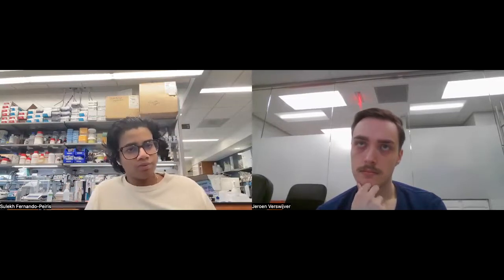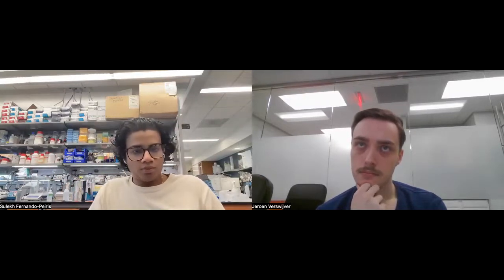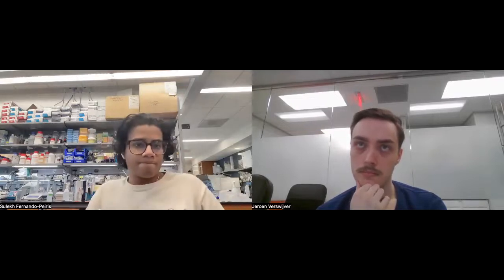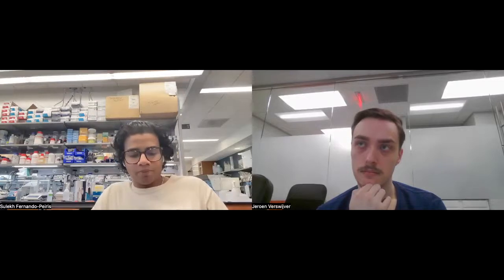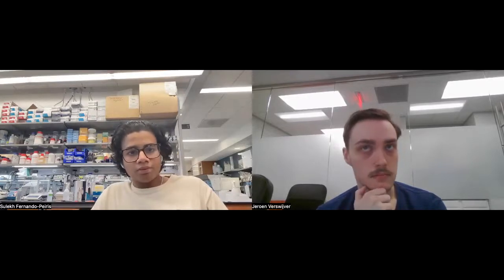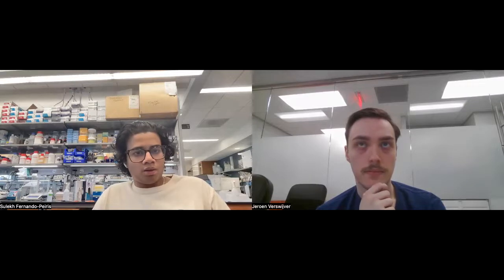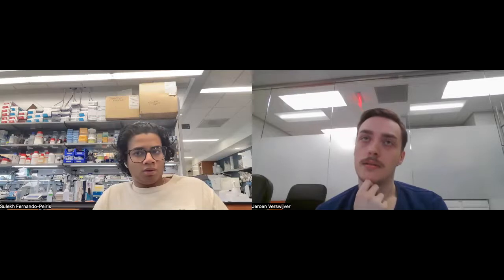Oh, yeah. So the workflow just meant something different to me before. You could certainly write a Python script that anticipated certain circumstances, but then you're in the position of having to call that Python script when you're doing this set of surgery. I'm not sure how that would interact with LabBook. I don't think LabBook's currently set up to allow multiple inserts at a single time. Not really.